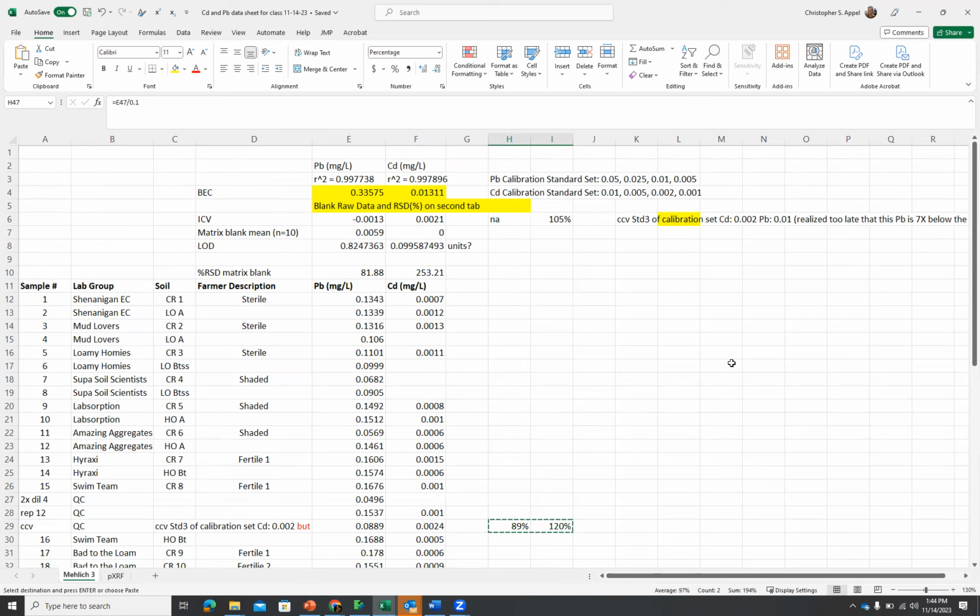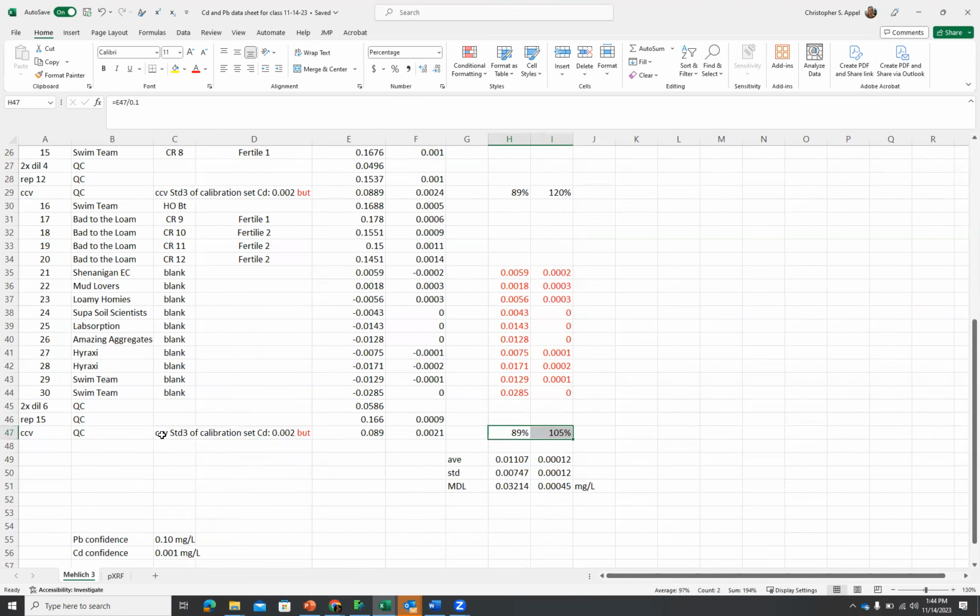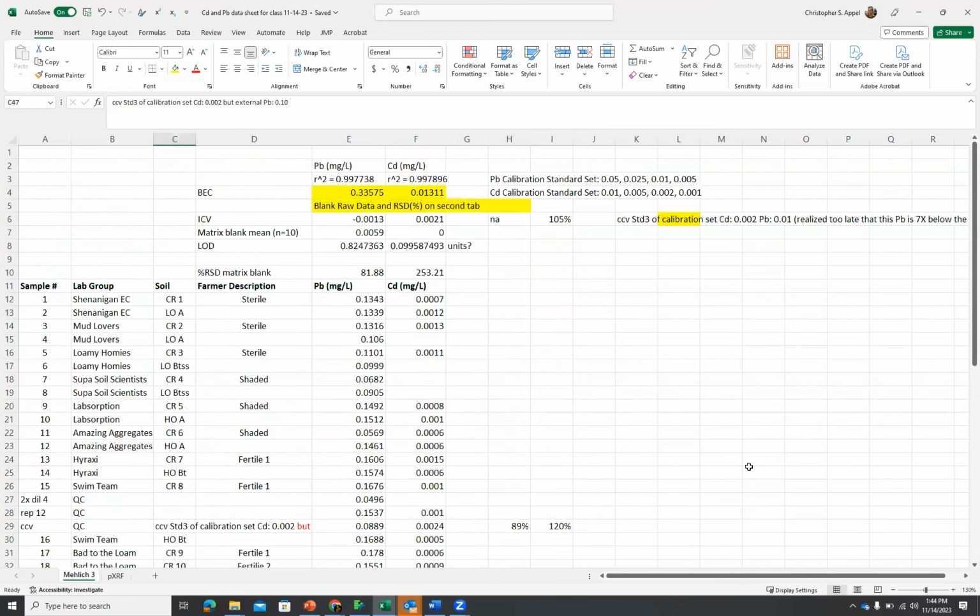Questions? Cadmium is 0.002 is the known. Lead is 0.1. Yeah, 0.1. Okay. What do you want to do next? Do you want me to choose? All right, I'll choose.